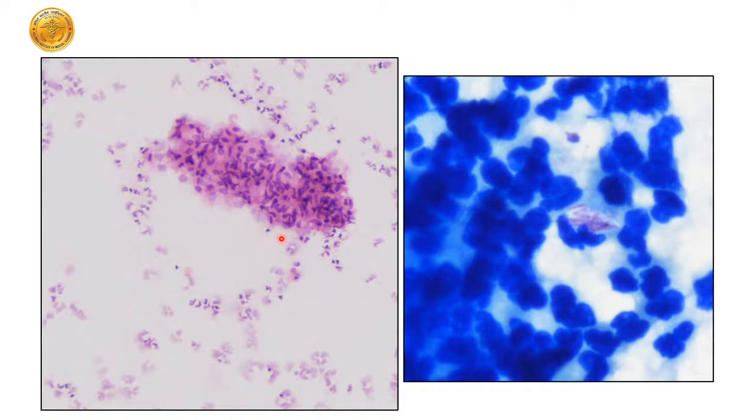We did ZN staining, the Ziehl-Neelsen modified staining, and we saw a lot of elongated acid-fast bacilli. We went back to the clinician and asked, can this patient be worked up for immune suppression? And we were not surprised when he turned out to be immunosuppressed, reactive for HIV.